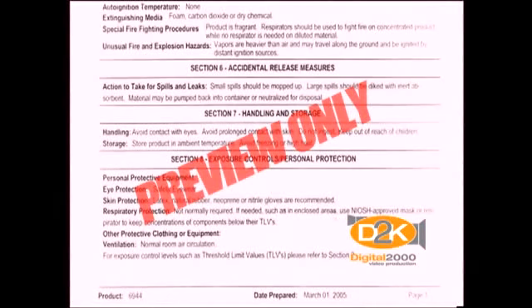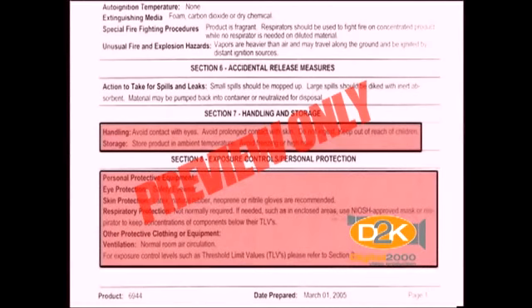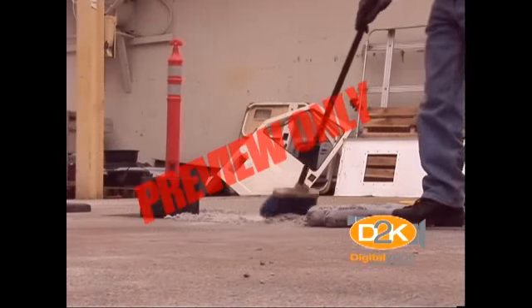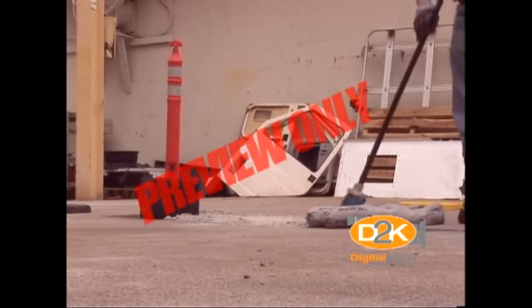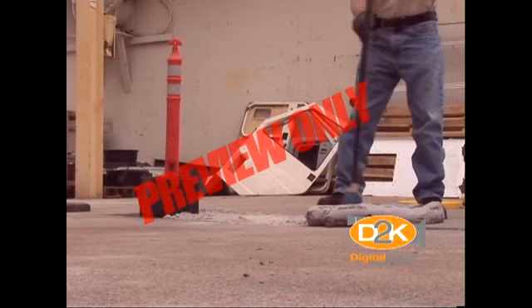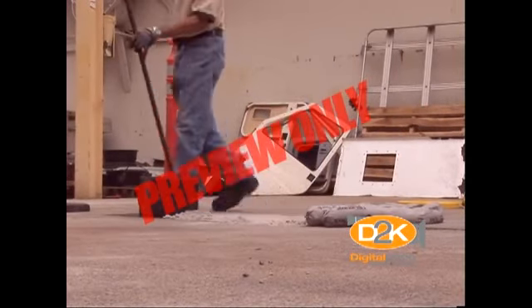The section on usage, handling, and storage describes how to clean up an accidental spill, leak, or release. This part will include any special procedures that might be required for cleanup. It will provide you with information on how to handle, store, and dispose of chemicals safely. Remember, if there is an accident, you must notify your laboratory instructor or professor immediately. You may take care of it yourself only if you are trained to do so and are wearing the proper personal protective equipment.